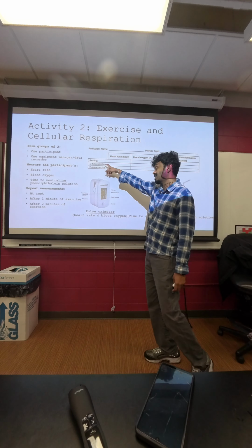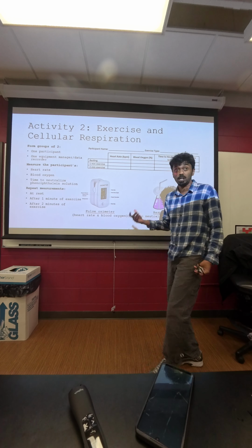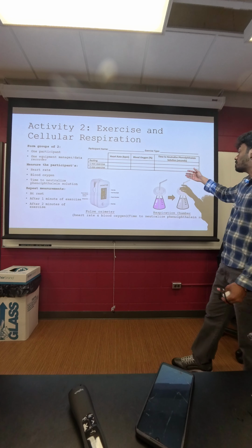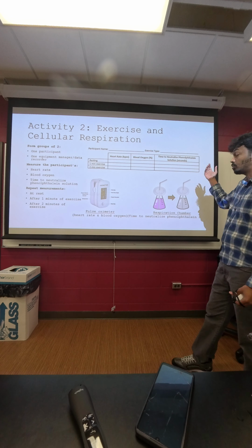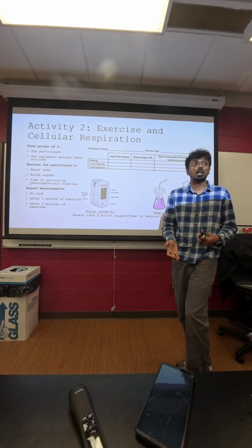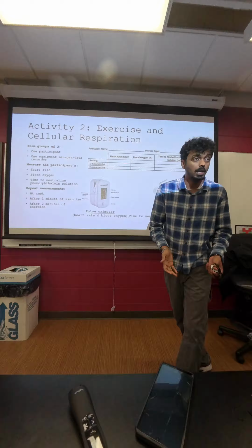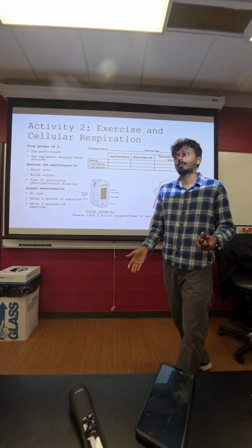Before we end, I just want to ask a simple question: when you have a 1-minute exercise and a 2-minute exercise, do you think the time required to change the pink color to the colorless solution will increase or decrease? With this question in mind, I request all of you to get started with this experiment. And as always, if you are stuck with anything, I'll be happy to help you out. Thank you again.